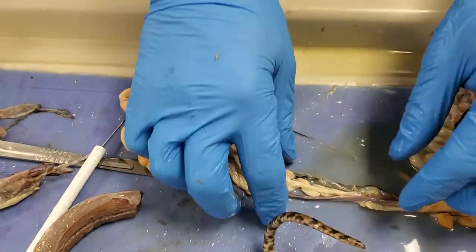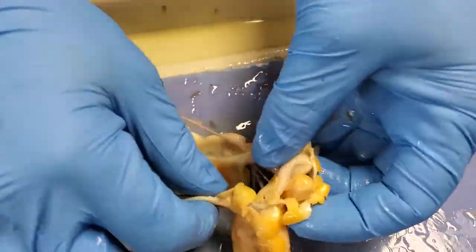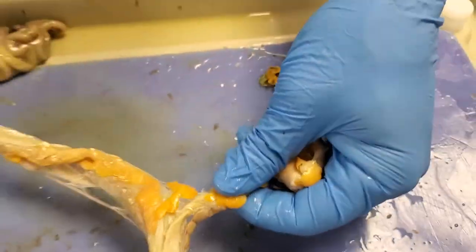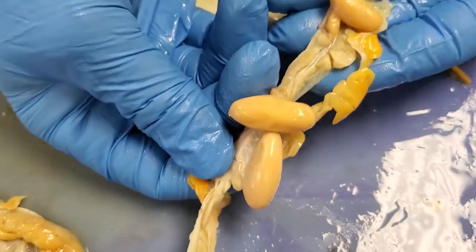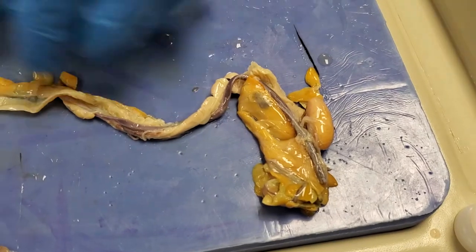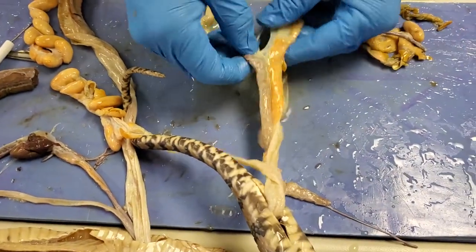So we've got those eggs coming off this material — this would be the ovary. Seeing those eggs, it's got to be a female. As I keep going down, here's the other set of eggs and ovary. I can pull those out — the ovaries and testes in the snake are a little offset, one a little more in front of the other, because the snake is relatively thin and it's hard to stack them side by side. So this would be the other ovary with more eggs. So lastly, continuing past this ovary, we get to the final little bit — two more organs, another paired organ, also slightly offset the way the ovaries are, just for saving space, and they are the kidneys.